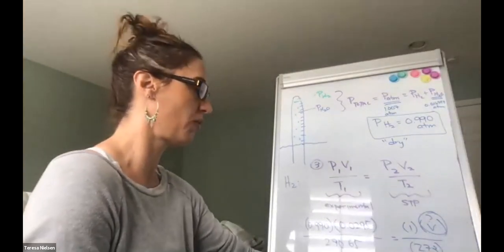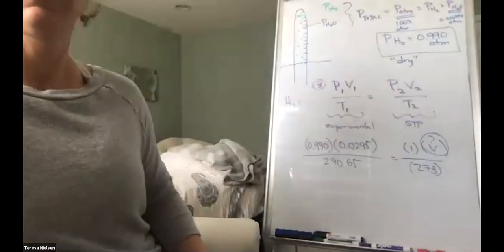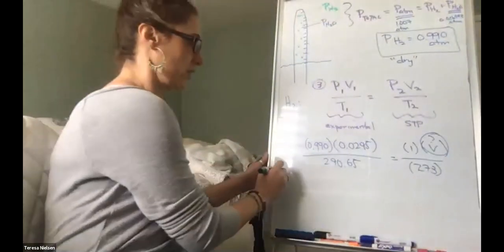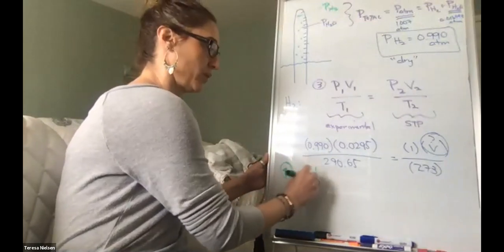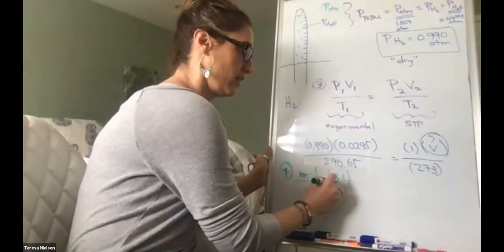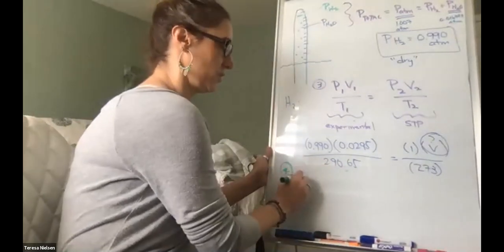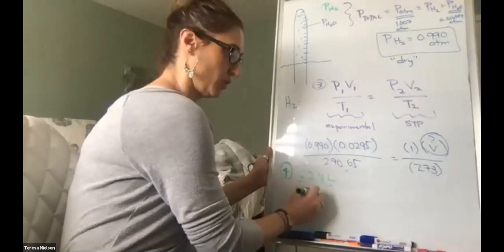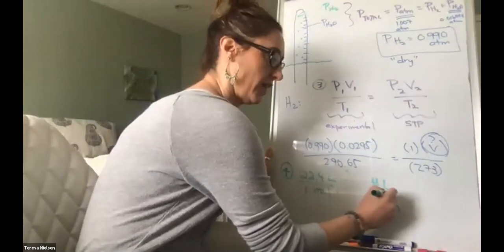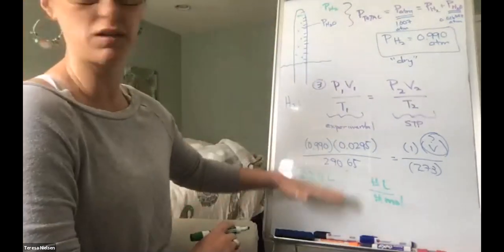Okay, and then step 4, this is a great example of what I like to call let the units be your guide. Where I'm asking for the standard molar volume of a gas in moles per liter. So you take the number of moles that you calculated in number 1 and you divide it by, I'm sorry, it's liters per mole. I take that back. We usually say it's 22.4 liters for every 1 mole. That's the theoretical, right? So if we take the number of liters divided by the number of moles, that'll give us a standard molar volume. In other words, the liters per 1 mole.